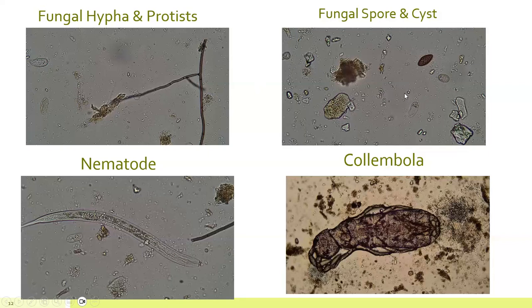And the reason why I chose this picture was because there's a few things happening in here as well. You have your microaggregates here, you have your sand particles here, or mineral particles. But here to the left side, you're also seeing what's called a cyst. Now there's a double wall on this, and there's all this nice stuff on the inside that is not active, but it's alive. And that's an amoeba cyst. So it's one of these guys that has cysted up. And the reason why they do that is because the conditions are not right for them.